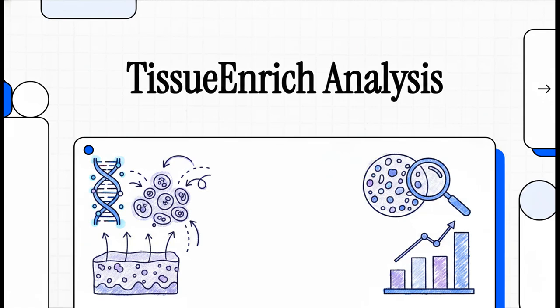All right, welcome to today's explainer. We are diving into an absolute lifesaver of a bioinformatics tool called TissueEnrich.